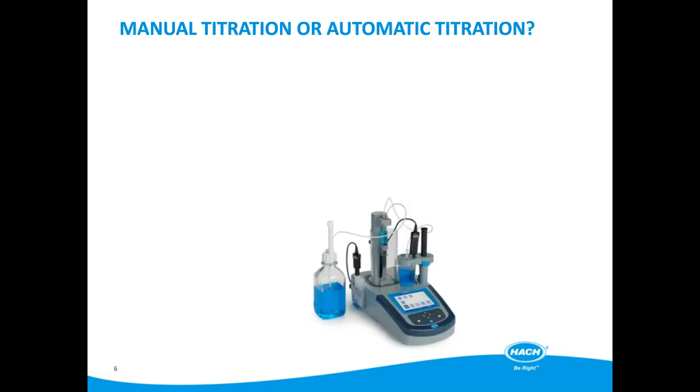Regarding automatic titration, the chemistry can be more or less the same, but the procedure will be completely automated. So it means that the detection is no more done by color indicator, but will be done by a probe, which will follow the titration.